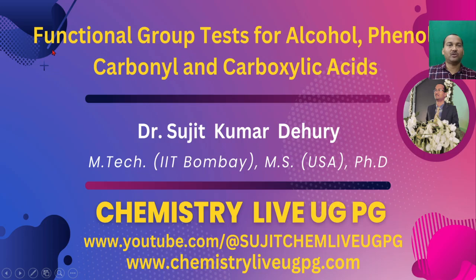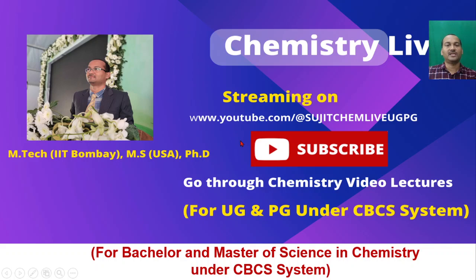Today we are going to talk about functional group tests for alcohol, phenol, carbonyl and carboxylic acids. This will be highly beneficial for BSc Chemistry students under the CBCS syllabus.